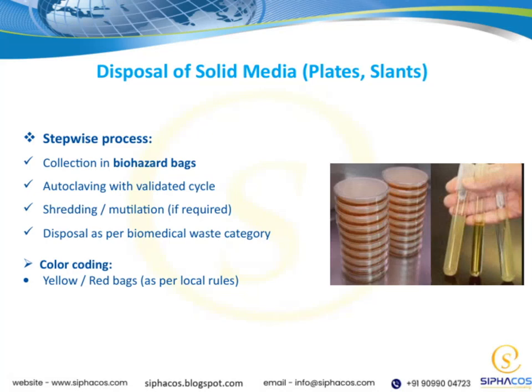Now, let's talk about the proper disposal of solid media like plates and slants. First, these items should be collected carefully in biohazard bags to prevent any risk of contamination. Once collected, they need to be autoclaved using a validated cycle to ensure all microbial life is destroyed.